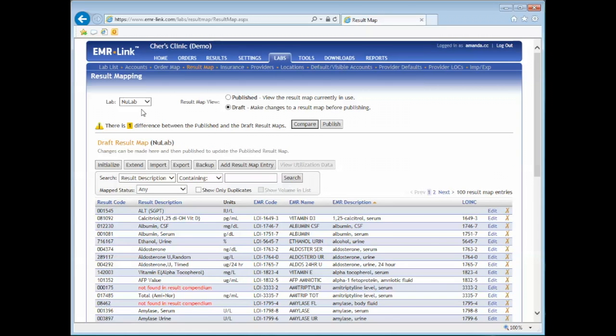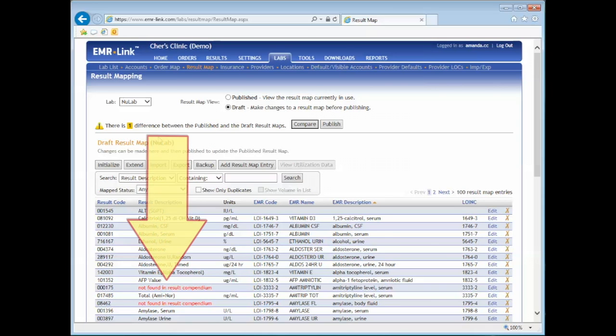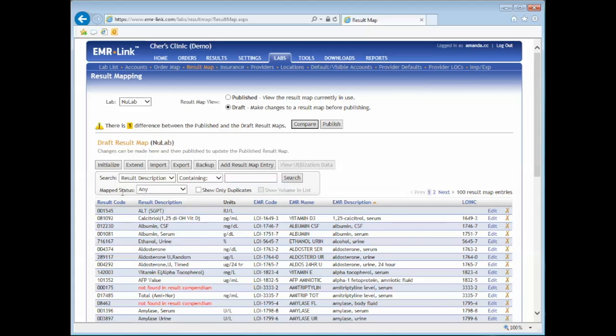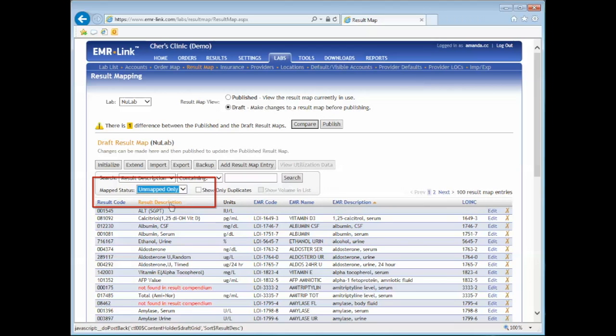When a lab provides EMR Link with an updated compendium, you'll see the obsoleted result code shown here. To see only the codes that need to be mapped, choose Show Unmapped Test Only.